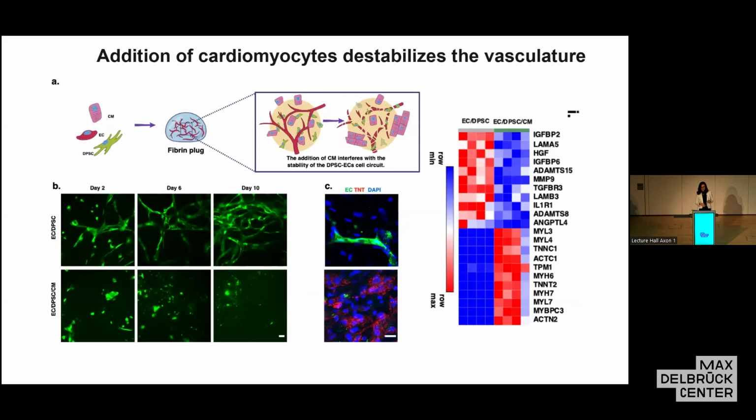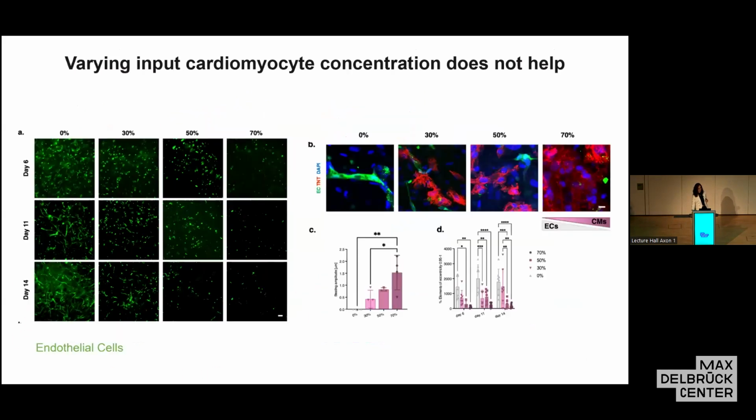So one obvious thing is, well, let's just add cardiomyocyte to this combination. So now you have 3 cell types. When you do that, not much happens. So look at this bottom row here. When you add cardiomyocyte, this vasculature, kind of microvasculature, goes away.